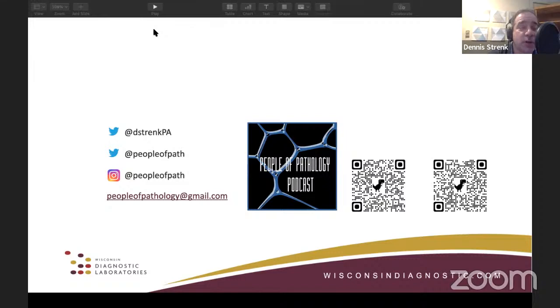They don't show up as well, especially red, because it can blend in with the H&E stain, with the eosin. And yellow and orange are sometimes microscopically difficult to tell the difference between. So I would say your three best bets are black, blue, and green.